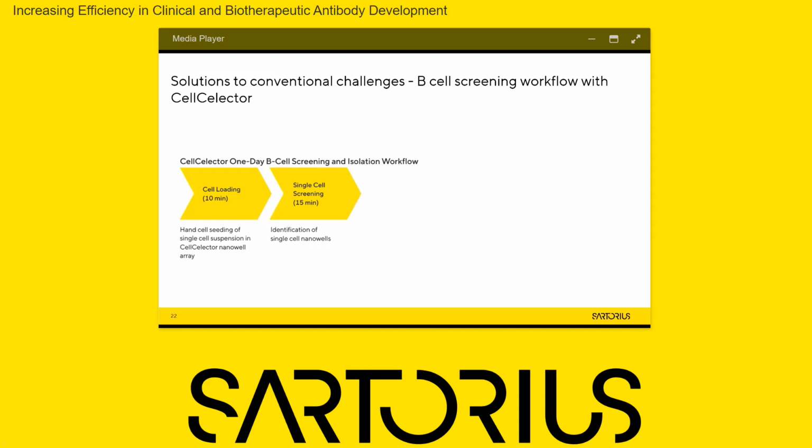It's an identification of single cell nanowells. So this would be performed on the CellCelector. You would scan and analyze your nanowell plate and identify your single cells. From there, you would then perform a secretion assay, which takes between 2 and 3 hours. And using the CellCelector, you could automatically detect the secreting cells using a fluorescence-based secretion assay. I'll go into detail about these in the next slide.